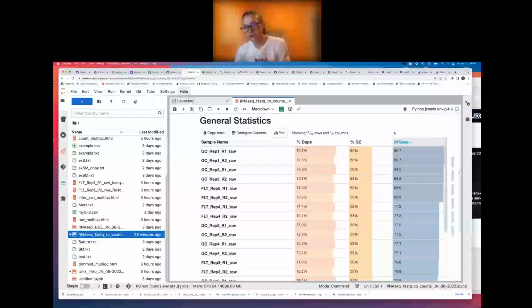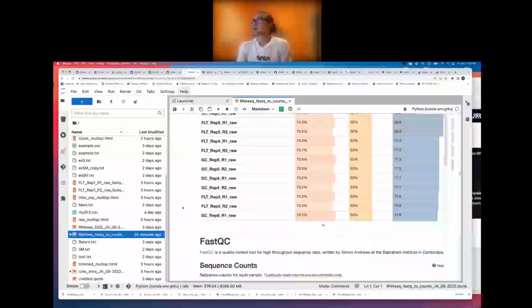Of course, you're throwing away data there, but now you can account for those read differences on the in silico side. I hate throwing away data, but sometimes if you get something that's drastically different that you're concerned about, I would probably run it both ways. I'd run it with all data included, and then run it again with the data cut off, and see if I get drastic differences in my differential expression. And if I do, I would know that it's because of the greater depth on some of the samples than others.